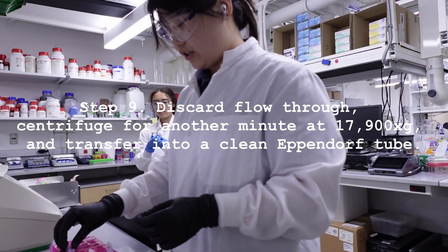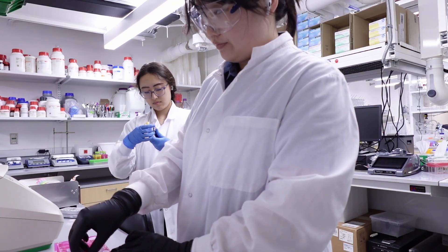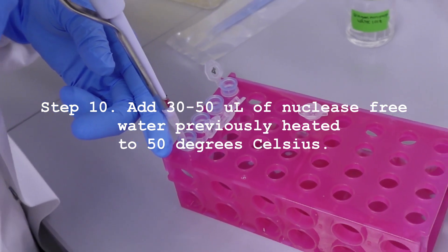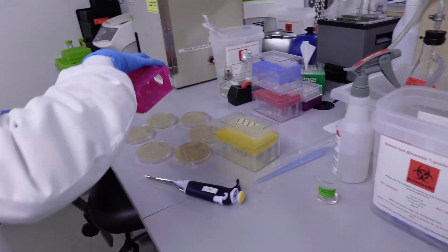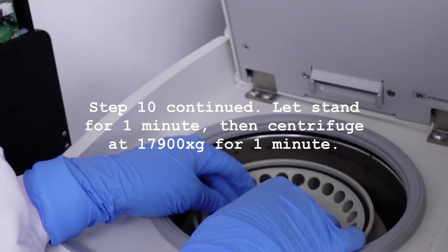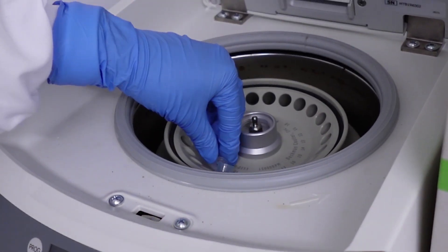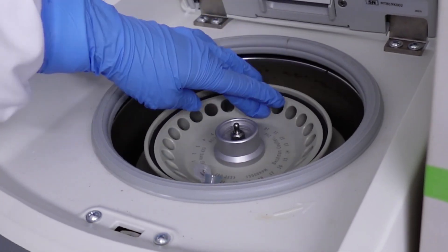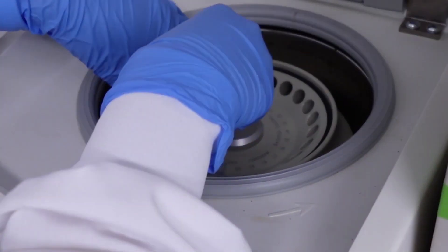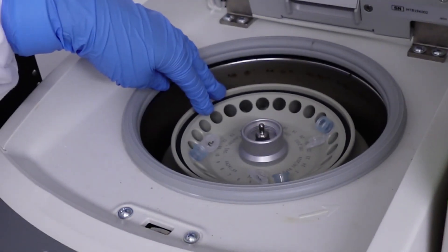Here I'm discarding the flow-through and then putting them into these microcentrifuge Eppendorf tubes. Now for our final centrifuge step. So here you also have to be a little bit careful because we have these open centrifuge tubes. And when you are centrifuging open tubes like this, you want to make sure that the caps are inside — otherwise the lid won't close — but also you want to make sure that they're kind of tailing behind the direction that the centrifuge spins. You can tell because there's an arrow. This prevents the caps from snapping off during centrifuging. We want plasmids at the end and don't want all kinds of cell debris.